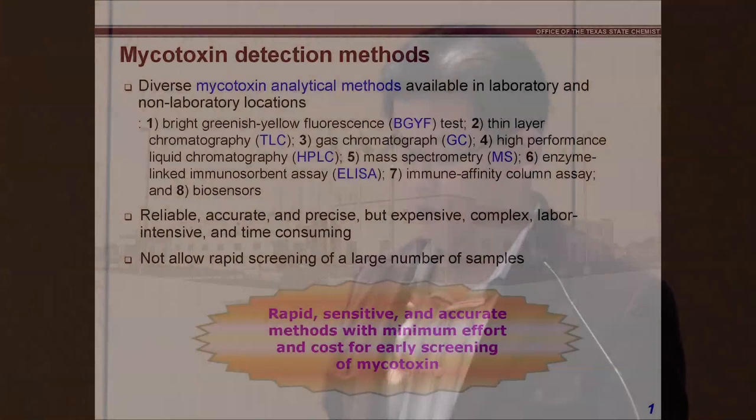My presentation title is Application of Raman Spectroscopy for Detection of Aflatoxins. As you know, there are diverse aflatoxins.